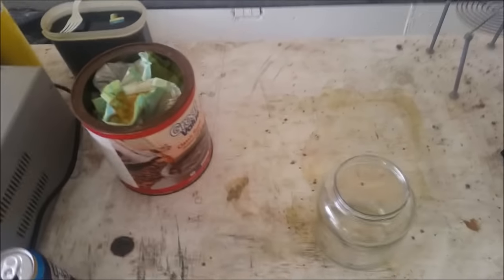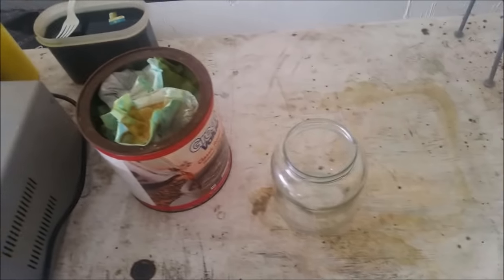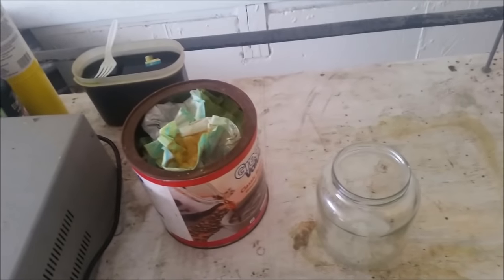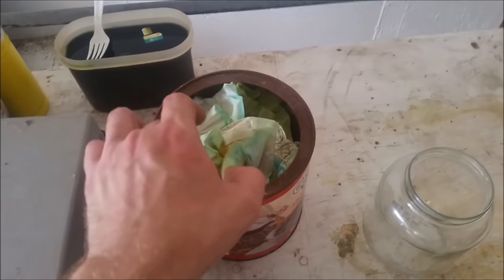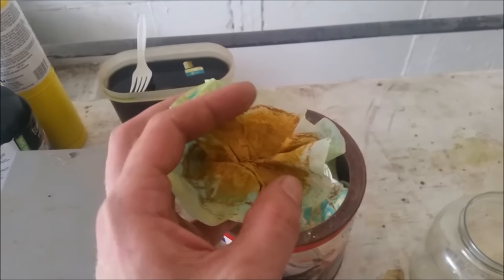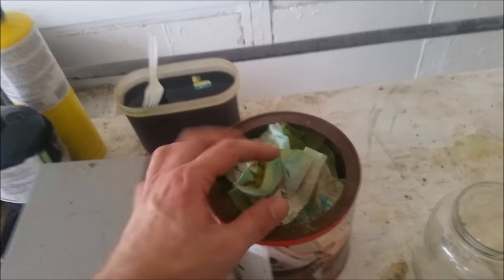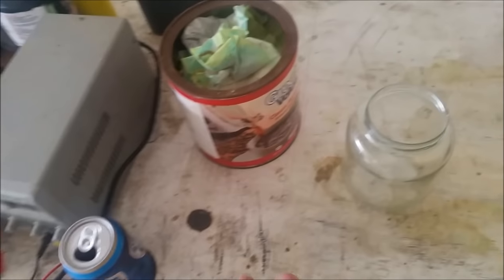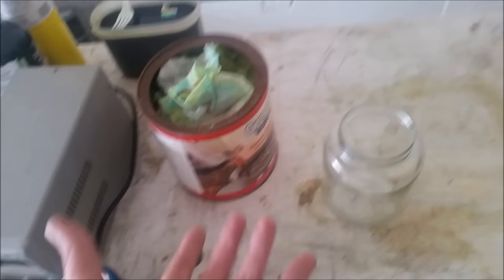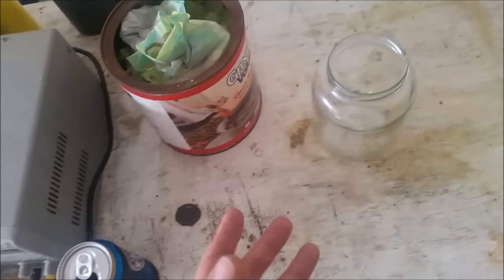Hey guys, so today I'm going to show you how to deal with chemical waste — well, a particular kind of chemical waste. These are filters that I used for growing copper crystals. What I would do is I would melt down a bar of copper wire or copper pipe, just source a large chunk of copper, melt it down into a bar, and then electroplate it into crystals.